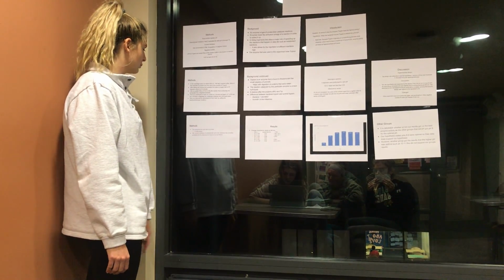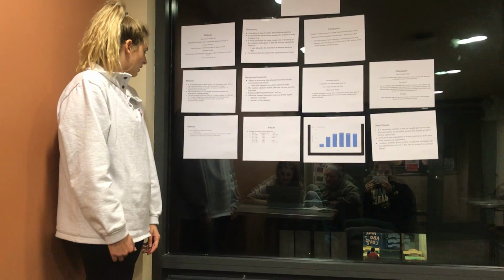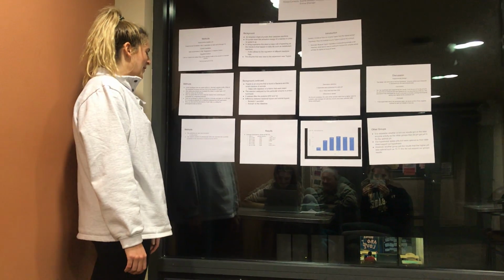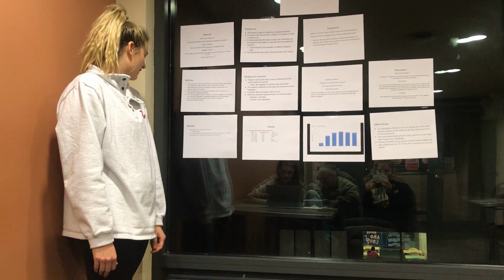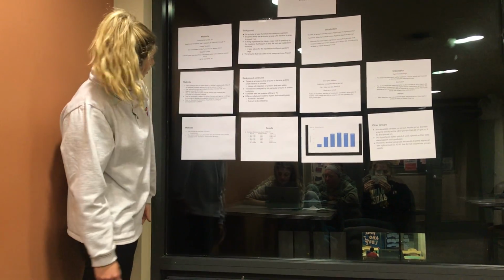The substrate we used was azocasin, which is a milk protein. The random addition of sulfonamide within the substrate has a positive correlation to the absorbance measurement at 440 nanometers.